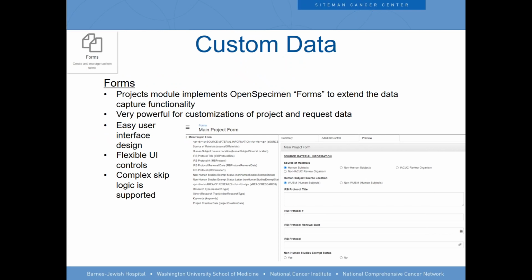So again, this gets away from a standalone request system where somebody goes in and just says, I want something done, and then emails have to go back and forth, or phone calls have to be made about the status of it. The person that actually makes the request can go in here and see the status of their request as it gets processed throughout the lab.